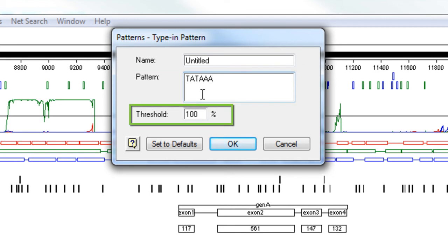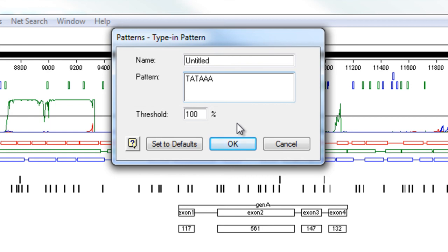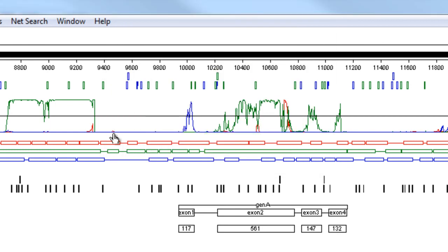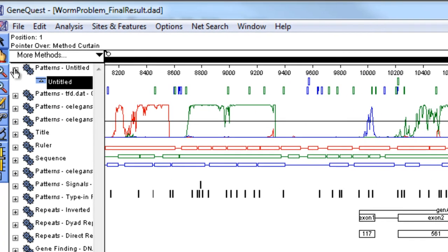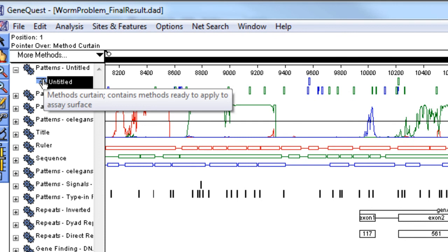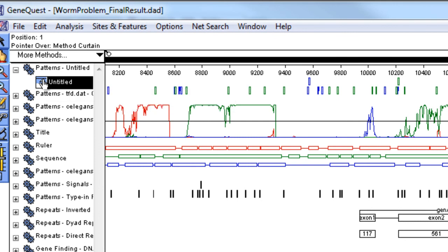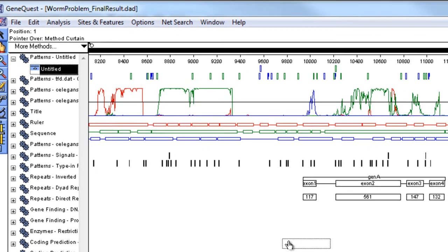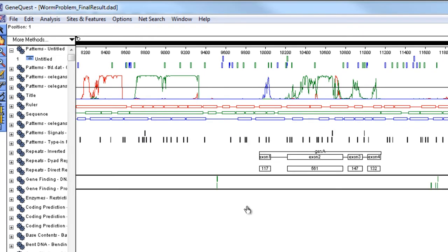I'm going to leave the threshold at 100 and click OK. Then click the plus icon to show the pattern I just added, and drag it onto the assay surface.